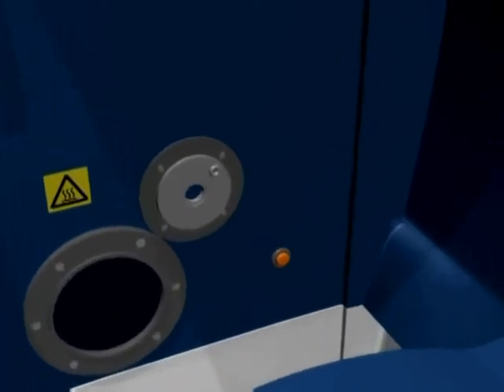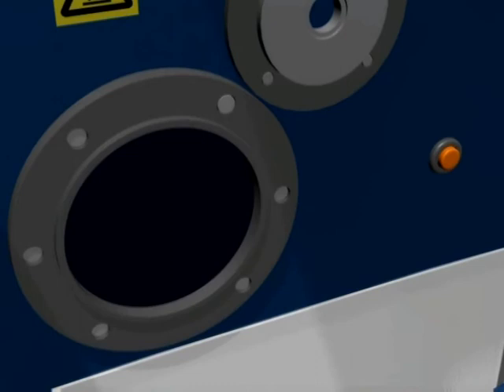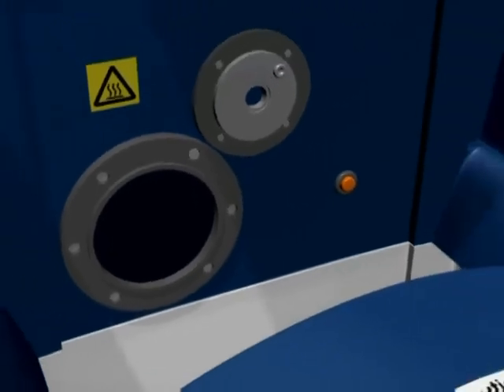You will see there is a location pin on the steel spindle inside the unit. Below the spindle is the source of the infrared light, which is often hot. The glass can be dusted with the cleaning brush or wiped with a cleaning cloth from the accessory kit.